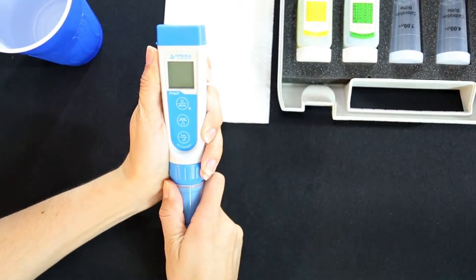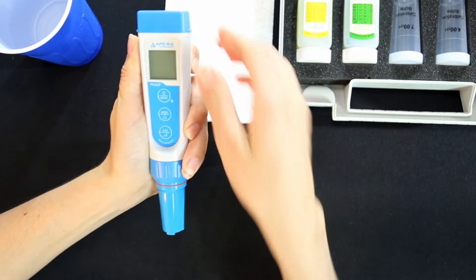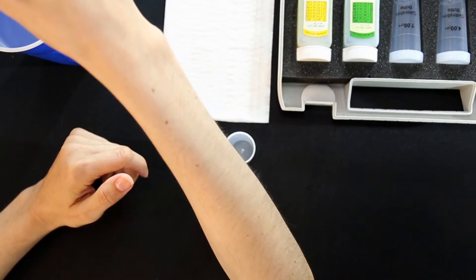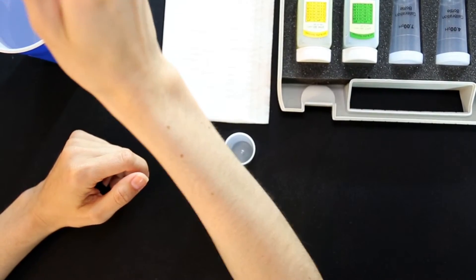After each use, the probe should be cleaned in distilled water. If the head of the probe is polluted or greasy, please use a soft brush and soap water to clean it.